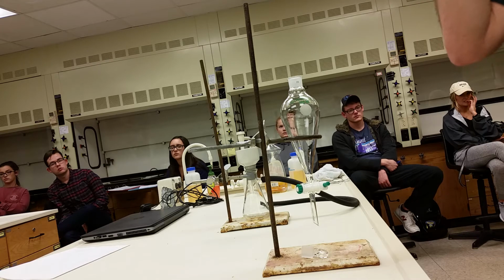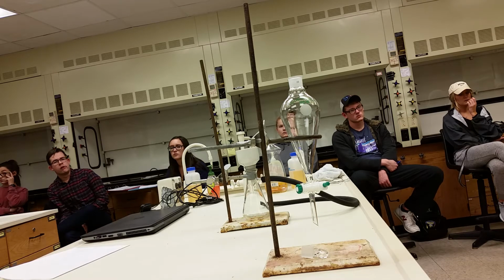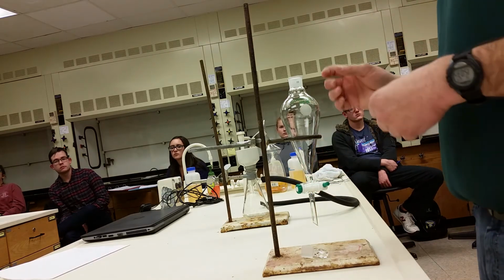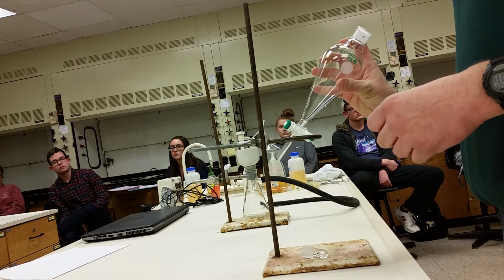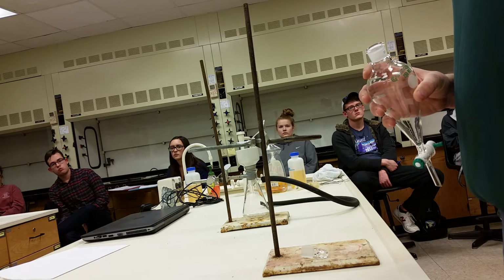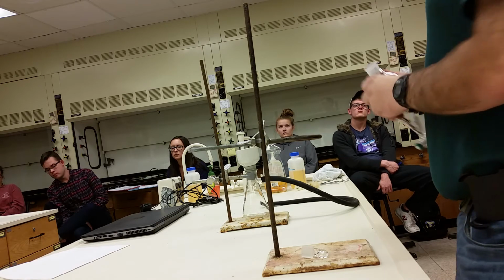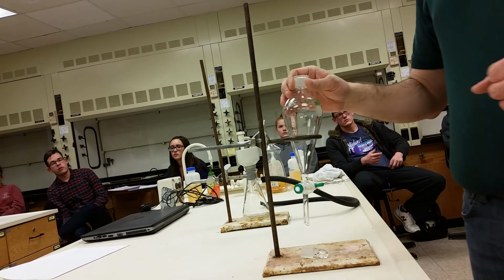Drain out the bottom layer into a beaker. You're going to get rid of it. Okay, it's waste. Stuff that's left over top is ethyl acetate. You're going to pick a 50 milliliter Erlenmeyer flask, take the separatory funnel out, pour the ethyl acetate into the 50 milliliter flask, and then you're going to put that onto your hot plate. You've pre-weighed the 50 milliliter Erlenmeyer flask, then you're good to go.